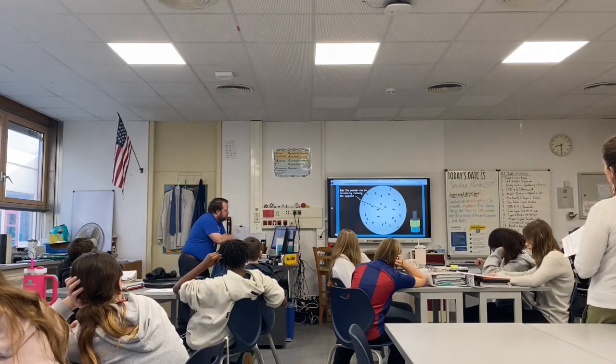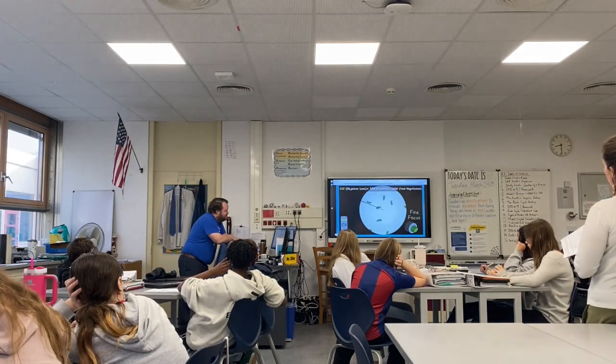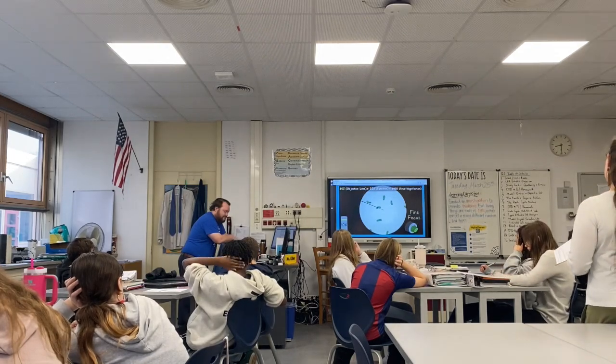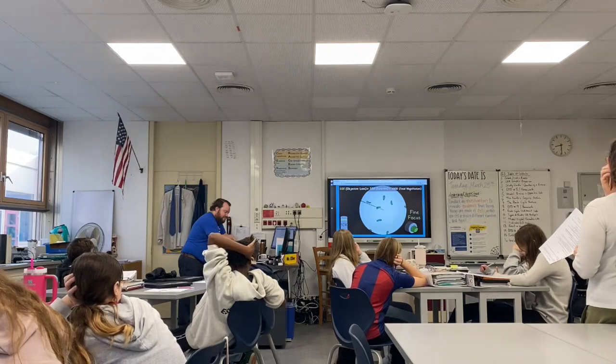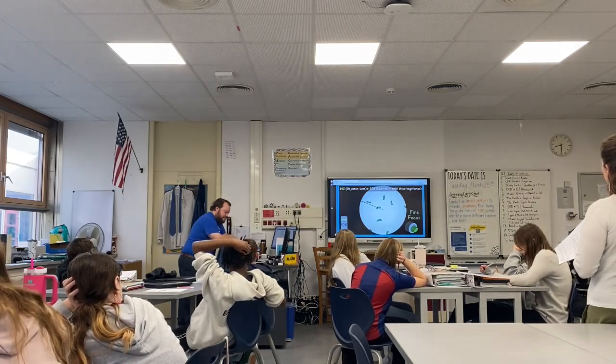Now that I've found it with the scanning objective lens, I'm now going to move up to the next magnification level. So remember, total magnification would be 100 times. Since I'd already focused it with the scanning objective lens, it's likely I only need to use the fine focus knob to adjust the focus.